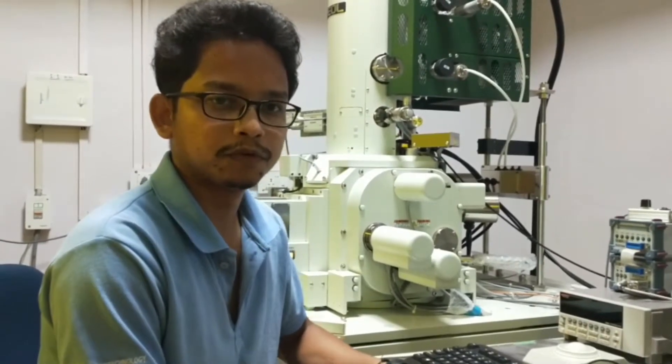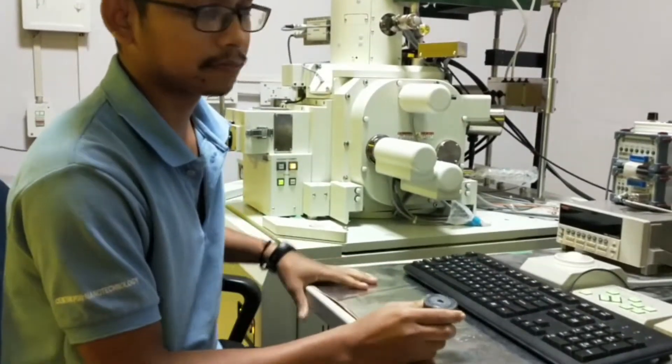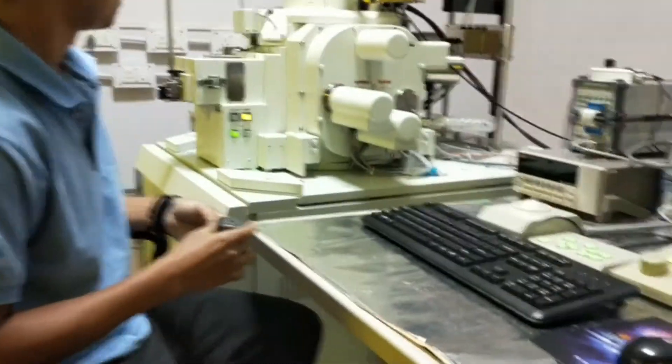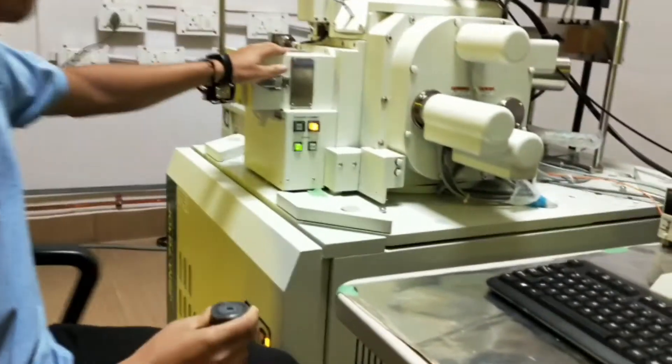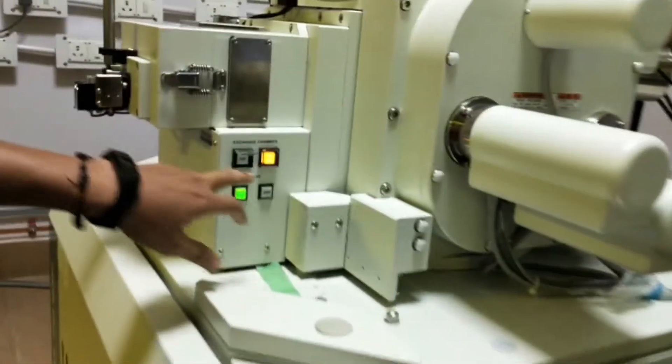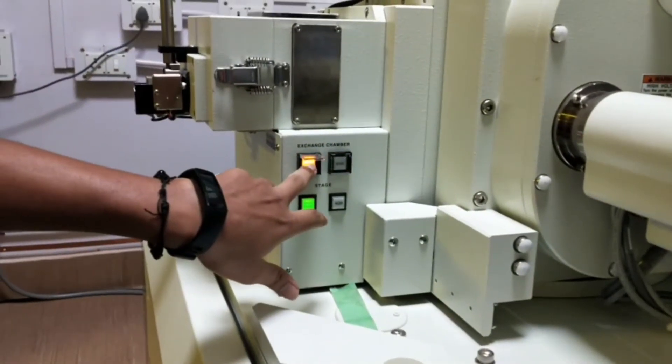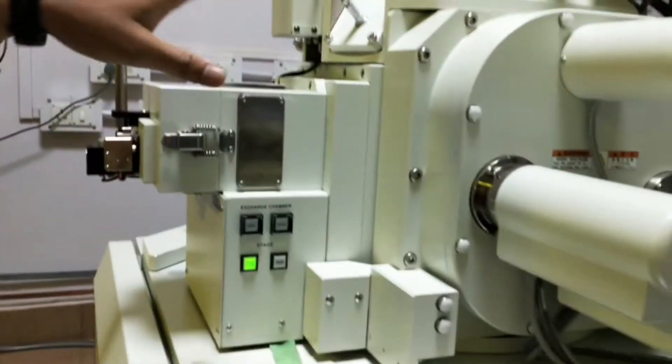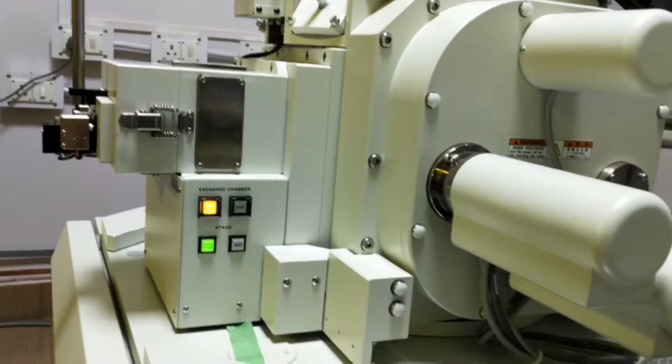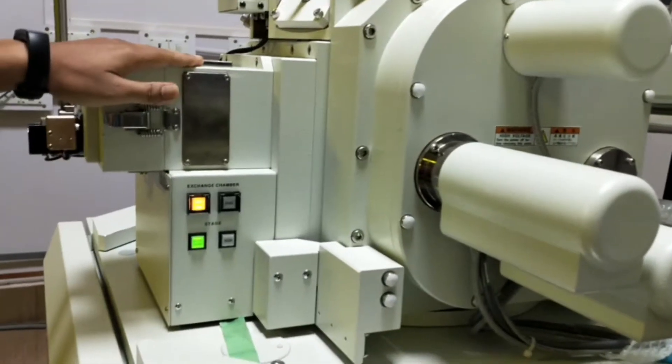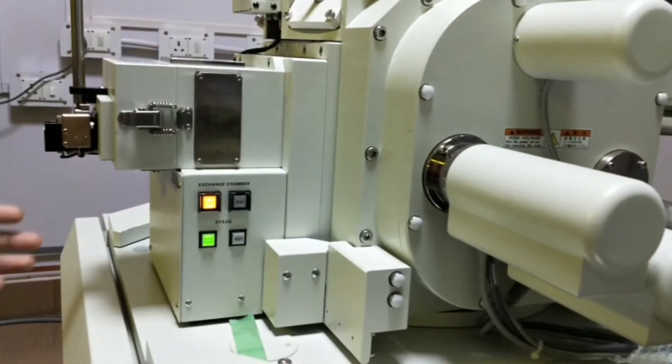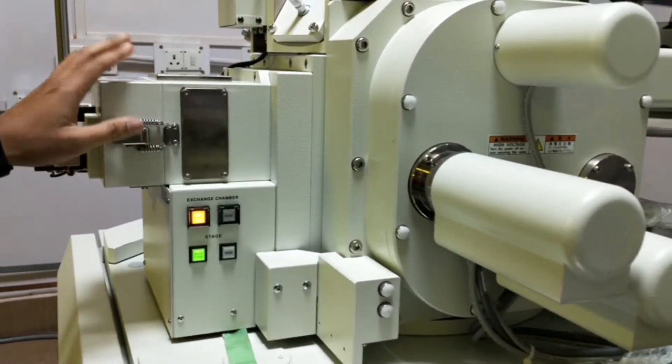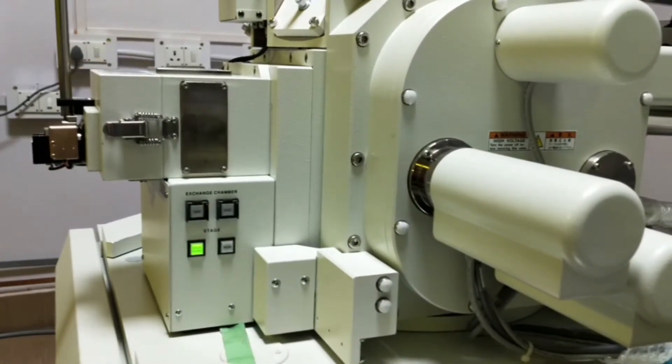Now I am going to put our sample, the butterfly wings, inside the specimen chamber. Before that, we have to vent the instrument because the whole system has to be in vacuum inside. Once this specimen chamber comes to the ambient pressure, then we can open the lid.